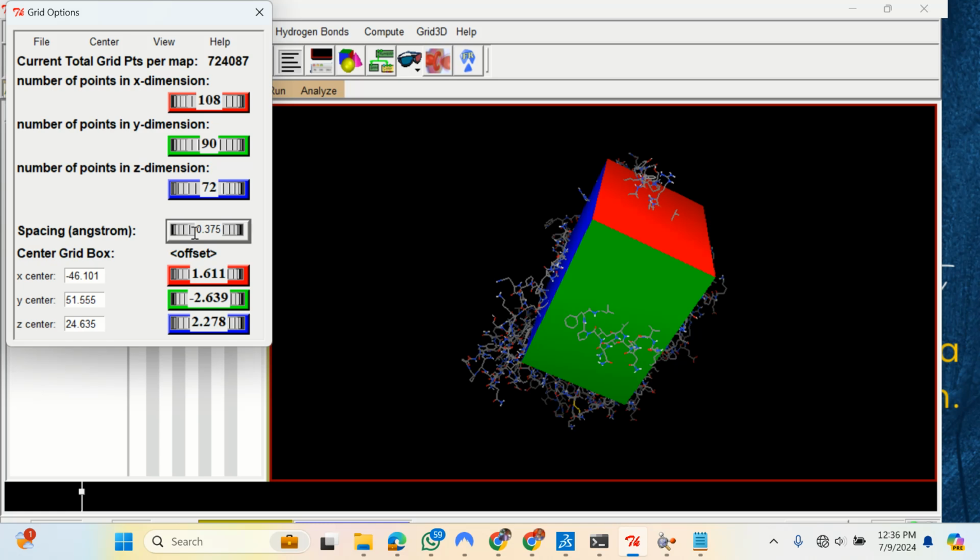No. That resolution there is just telling you about the quality of the protein structure, the 3D structure of the protein. Are you getting it? Yeah, whereas this is just all about the coordinates, that focus. Yeah, you can save this.